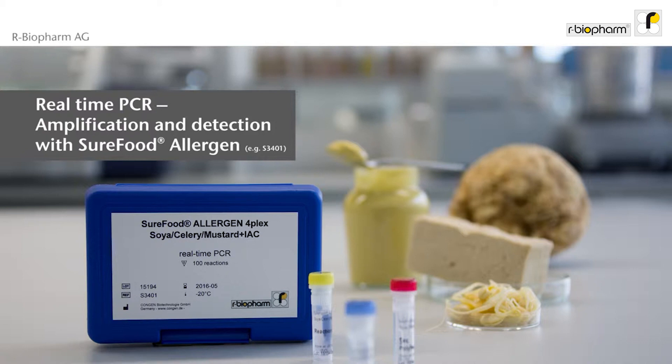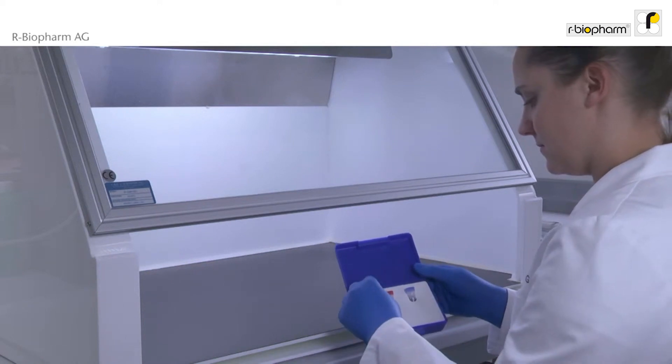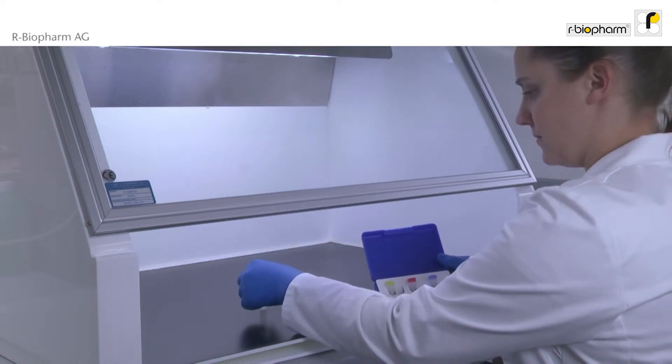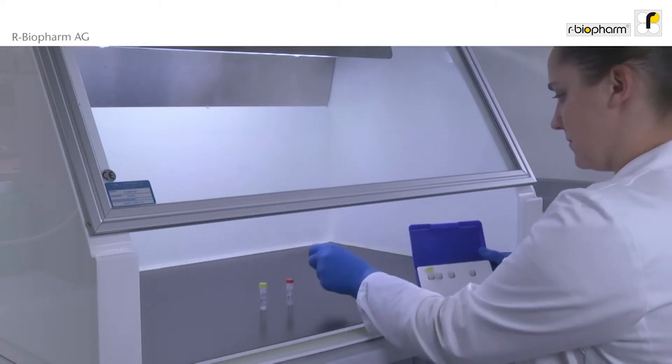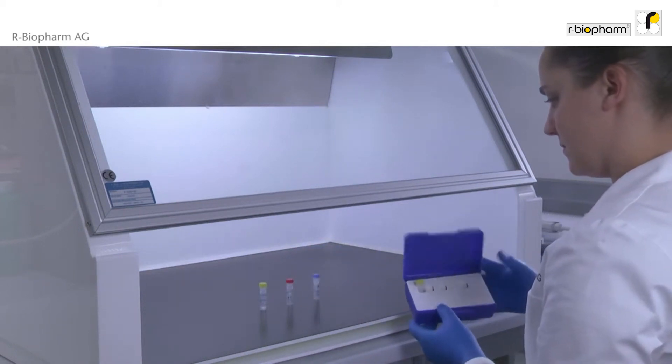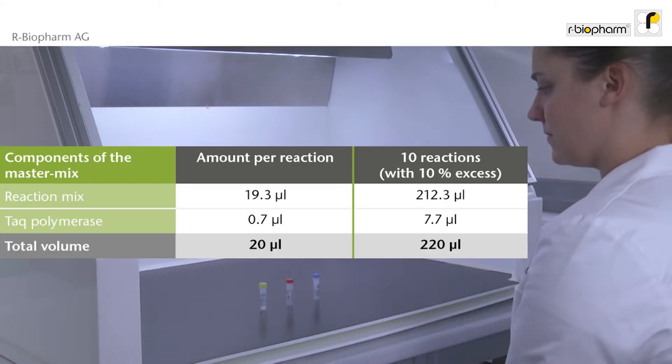The test kit procedure is similar for all other allergen real-time PCR kits. The reaction mix with a yellow cap should be completely unfrozen before starting. Only Taq polymerase with a red cap should be kept at minus 20 degrees centigrade until use. Calculate the total number of reactions, samples and controls according to the table, and calculate 10% additional volume to compensate for reagent loss during pipetting.